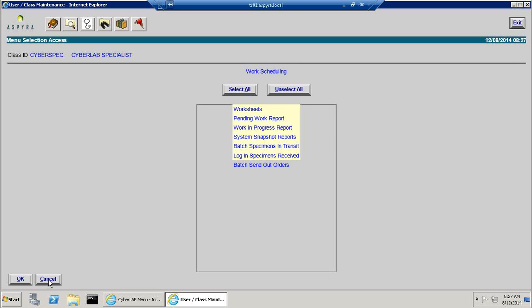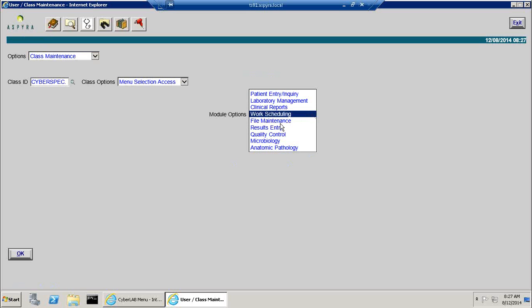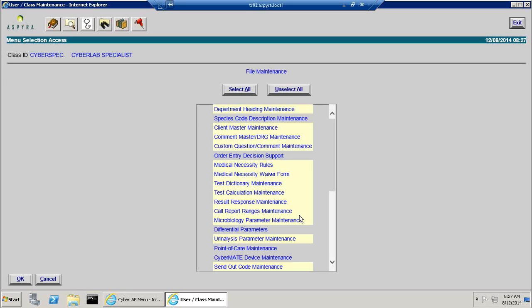Primarily I'd go through one pass and just say we're not doing, for example, standing orders or we're not doing collections. Let's go through and take all of those away from everybody. It doesn't do any harm for them to be there, but like I said, it just makes it a little more convenient.